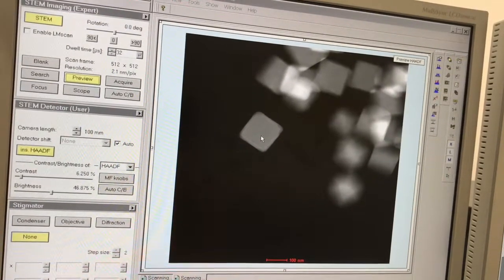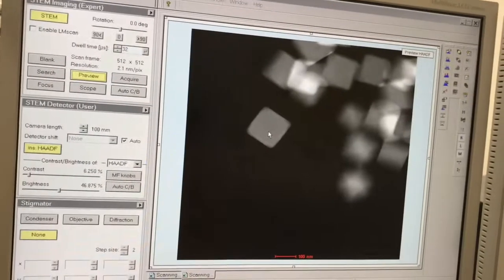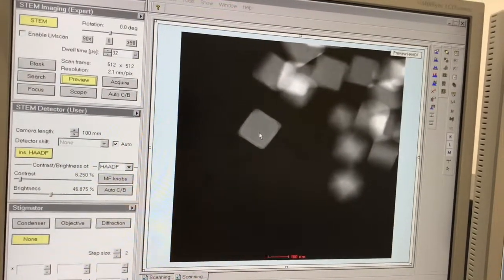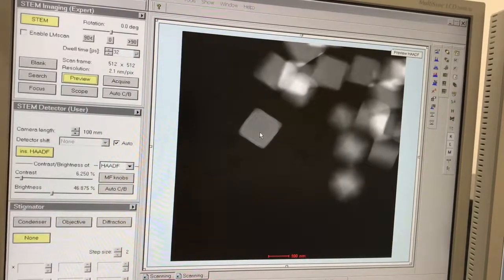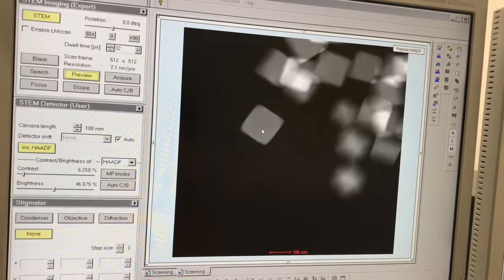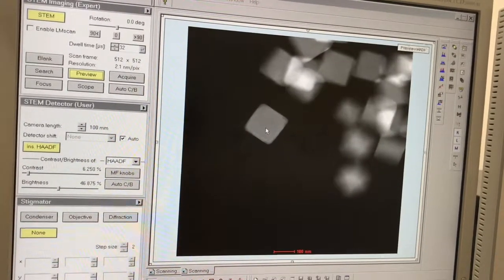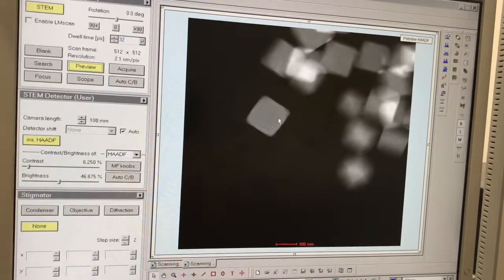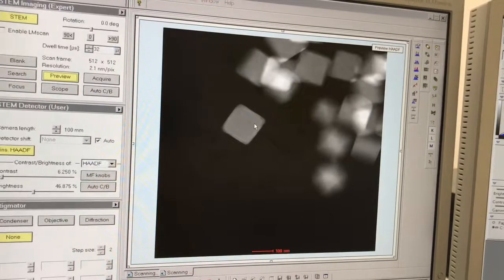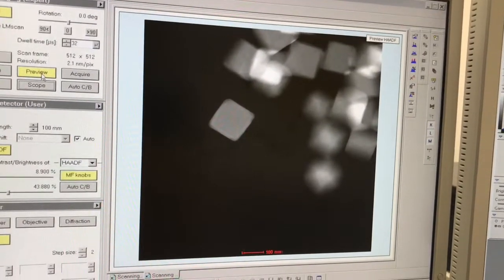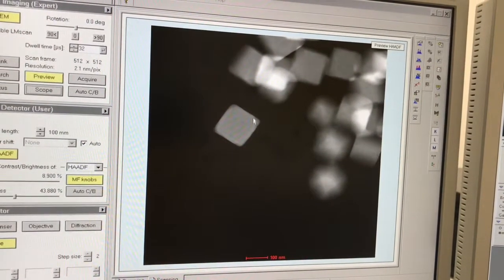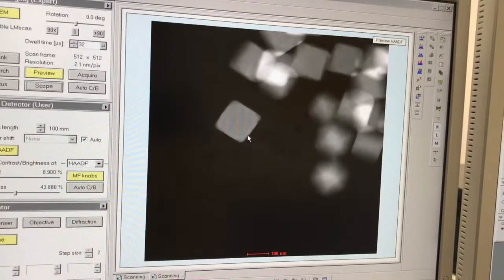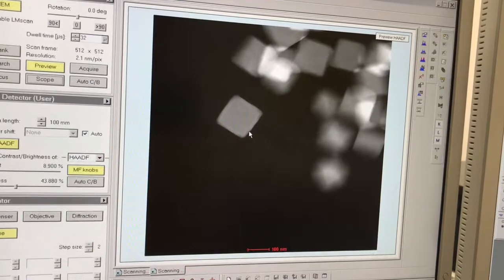If you were working with a film on a substrate, you'd need to orient the specimen so the interface between the film and substrate was parallel to the beam direction. This is very much analogous to that — we have the interface between the shell and the core, and our beam is basically traveling directly along that interface. That's what you need for an optimal spectrum image. I made a slight adjustment to the detector contrast and brightness, so it's probably a little easier to see the shell around the core now.